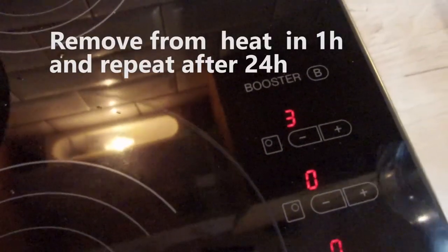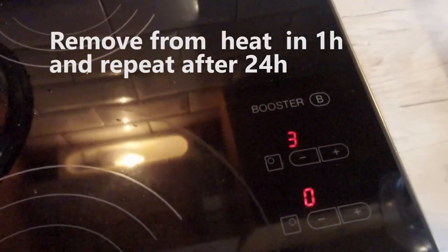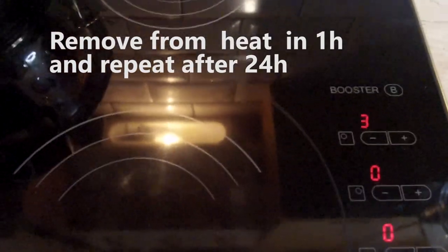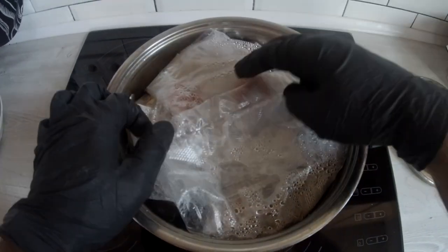After that, remove the pot from the heat but don't open the lid. In 24 hours we repeat the sterilization cycle.